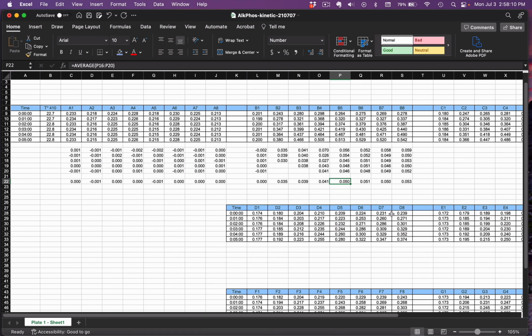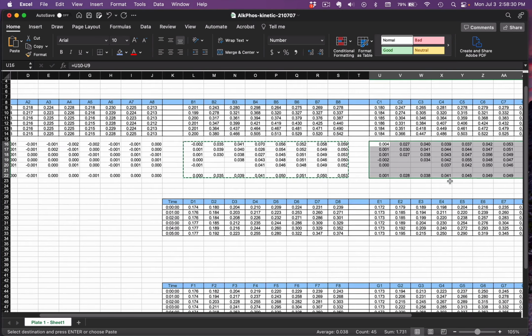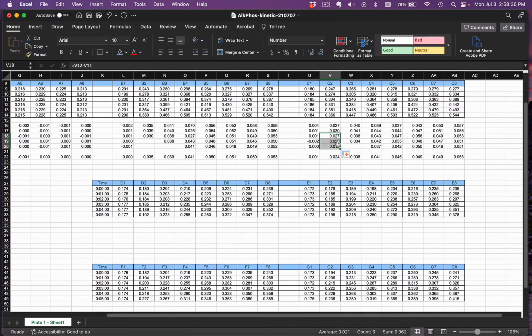Here, it's pretty indicative of the entire set. Same thing here, although we're not seeing much of an increase. Basically, we're looking at a point here where we're probably getting to enzyme saturation. So I'm going to just copy this, and I'm going to paste it over here. And we see somewhat similar results. I can pull this down to see if we get better data there. We don't really, so I'm just going to go ahead and delete those again.